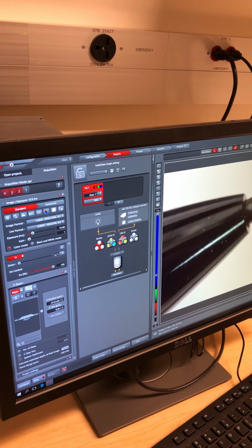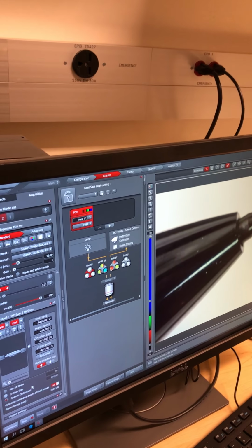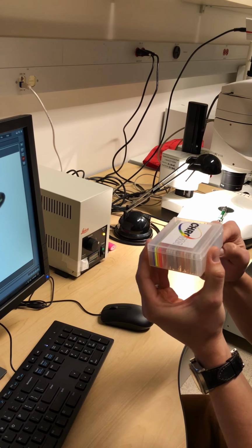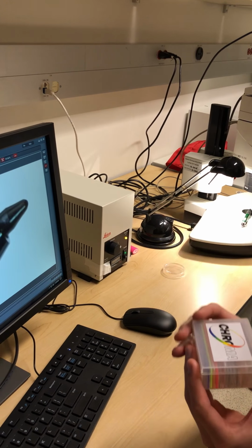Alright, so that's good. So you're setting your Z beginning and end points. The idea is that you want to have Z-stacks through the entire specimen. So I always recommend starting at the bottom and then marking the top. That way you're pushing against gravity.